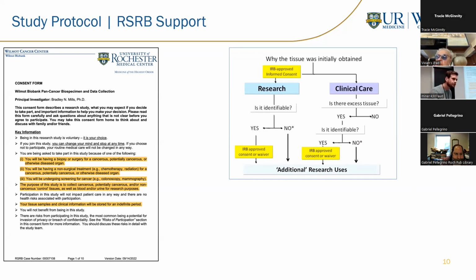Yeah. So for all the treatment, even the new treatment in our system, you will collect the product before treatment and after treatment and follow? Yeah, we try to. We're building this up, right? So right now we're doing our best, with the resources we have, to collect what we can. But absolutely, if there's a specific study or time point you're interested in, we can obviously start building in those collections, right? Maybe it is pre and post therapy, or maybe targeting more recurrent tumors or re-resections, right? We can absolutely build that in if we don't collect it, but in general, the scope, right? All the different primary origins that are present here, even if we just focus on solid tumors, there's a lot to collect, right? But absolutely, we want to collect what you're interested in. So if you come to us with something, if we don't have it, we can add it in and begin those collections.